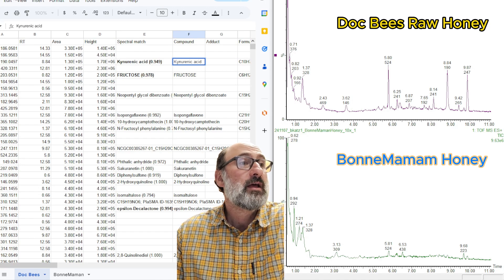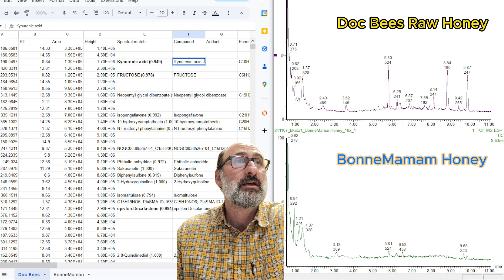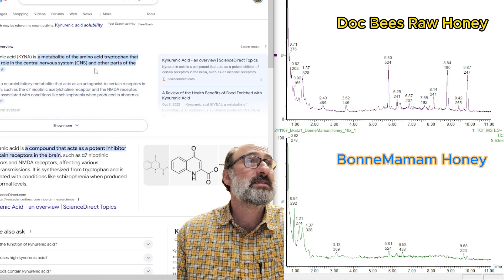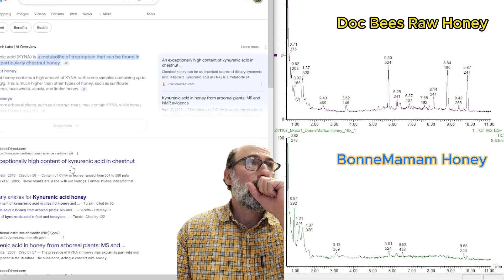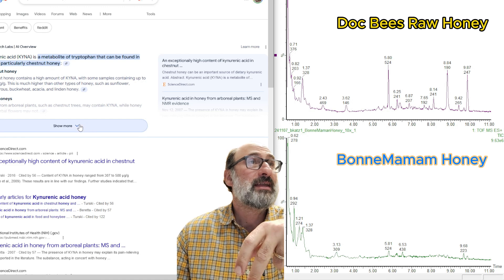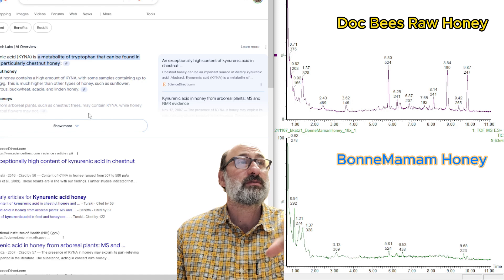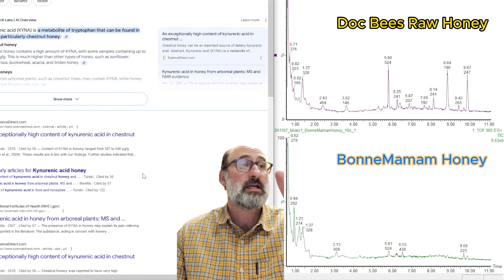This is the untargeted data using MZmine, with the Dockbeez honey up first. The first peak I want to show is at m/z 190, at 8.84 minutes retention time. This is kynurenic acid — I'm probably saying that wrong. If we search this compound, you can see it's a metabolite that can be found in honey, and it's typically found in higher amounts in honey that has been multiflorous — meaning the bees have gone to many different types of flowers and trees. This is kind of an indicator of good floral honey.